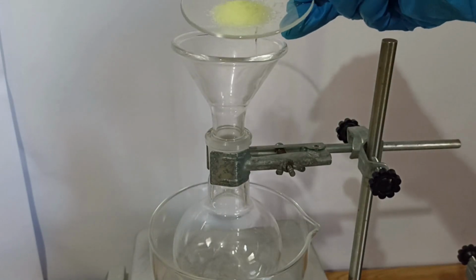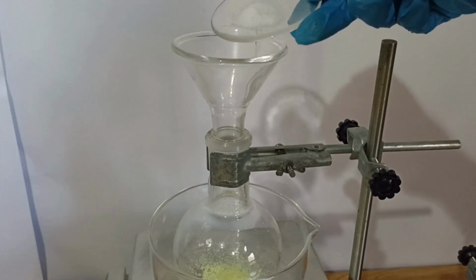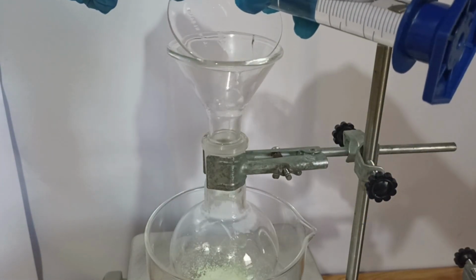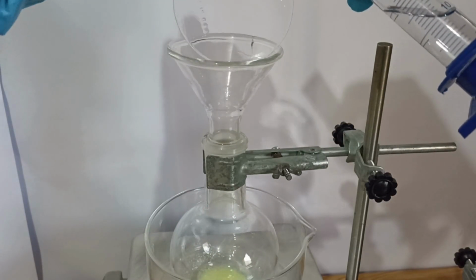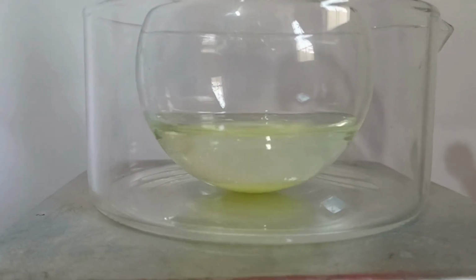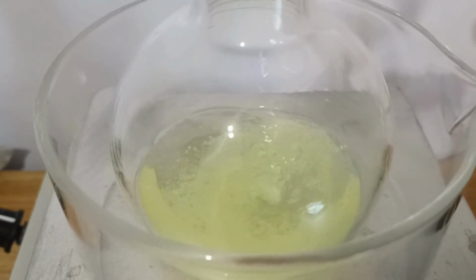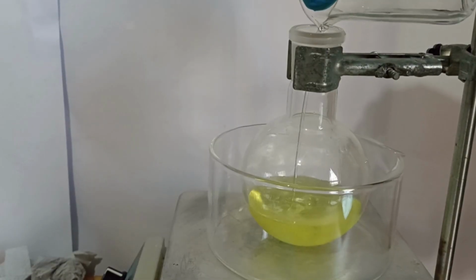The synthesis starts by adding the benzil and the urea in an adequate round bottom flask. Then add 50 milliliters of 96% ethanol. Drop a stir bar and start mixing. While stirring, add the 3 grams of sodium hydroxide dissolved in 10 milliliters of water.